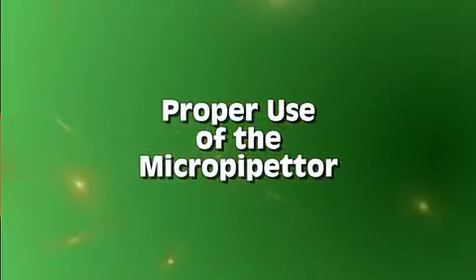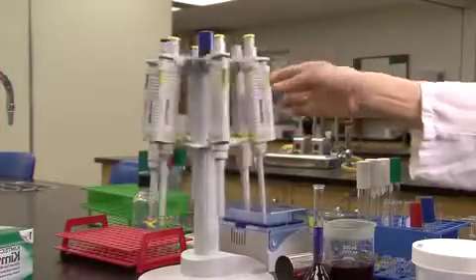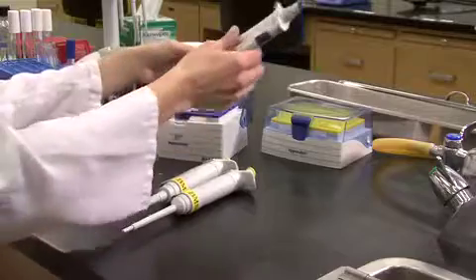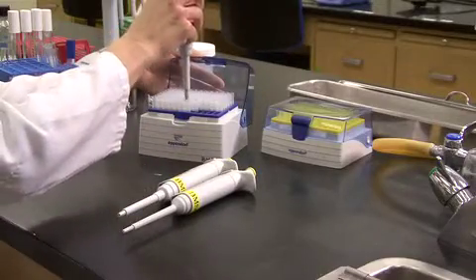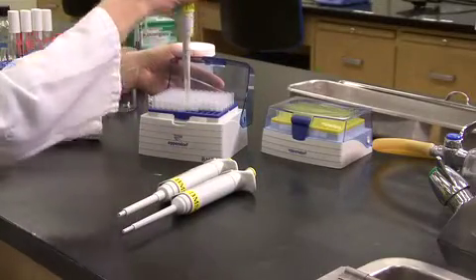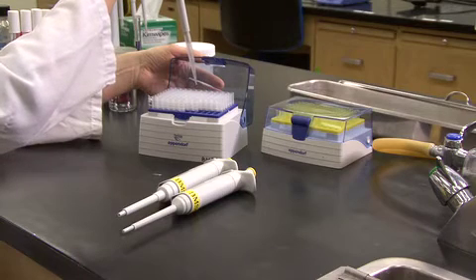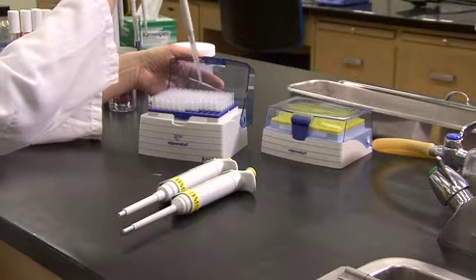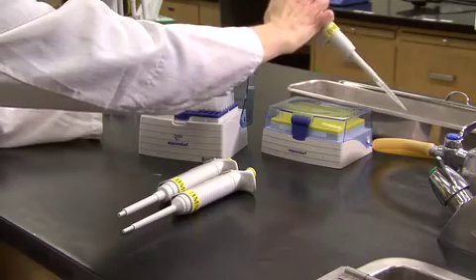To use any of these micropipettes after setting the volume, you must first attach a plastic disposable tip. The liquid to be measured should never enter the pipette itself, only the tip. By firmly pressing the pipette down into the tip, you will create a snug and airtight fit, while allowing the tip to be easily removed once it's no longer needed.